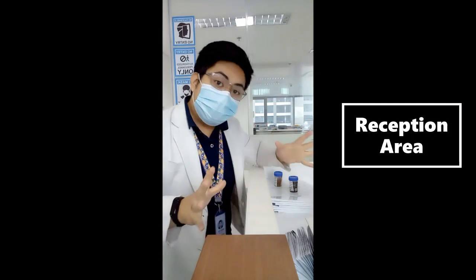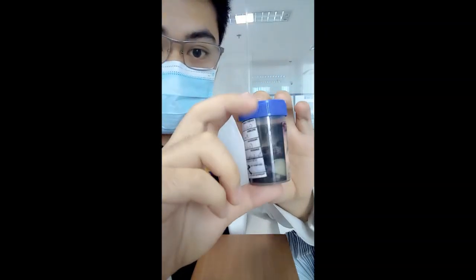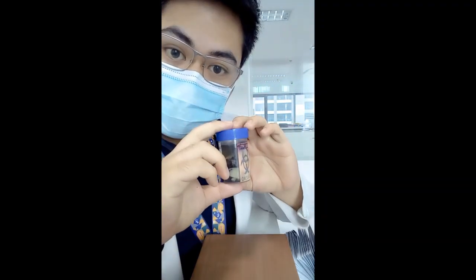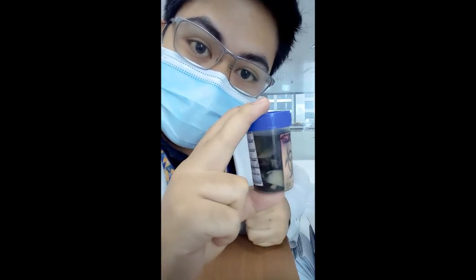Okay, so every laboratory starts with a receiving area. This area is where samples get sent to for logging and processing. These are examples of our different types of tissues. This is an example of a breast mass. This type of tissue, or any particular type of tissue actually, is submerged in what we call formalin. This formalin is what fixes the tissue so it does not degrade or decompose anymore.